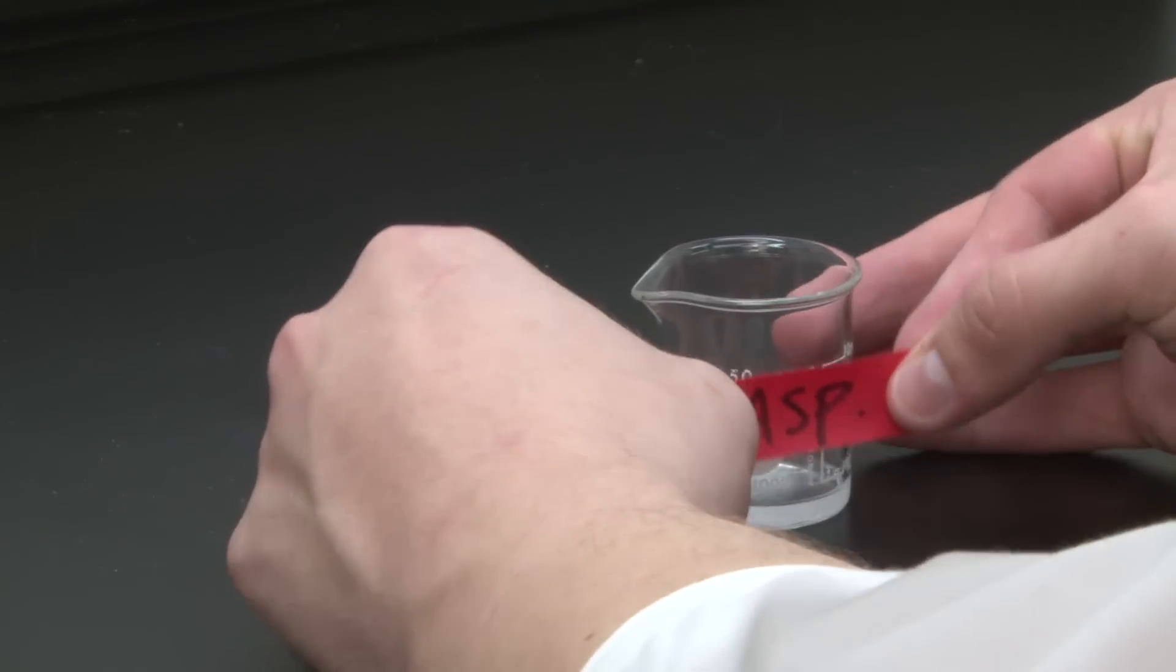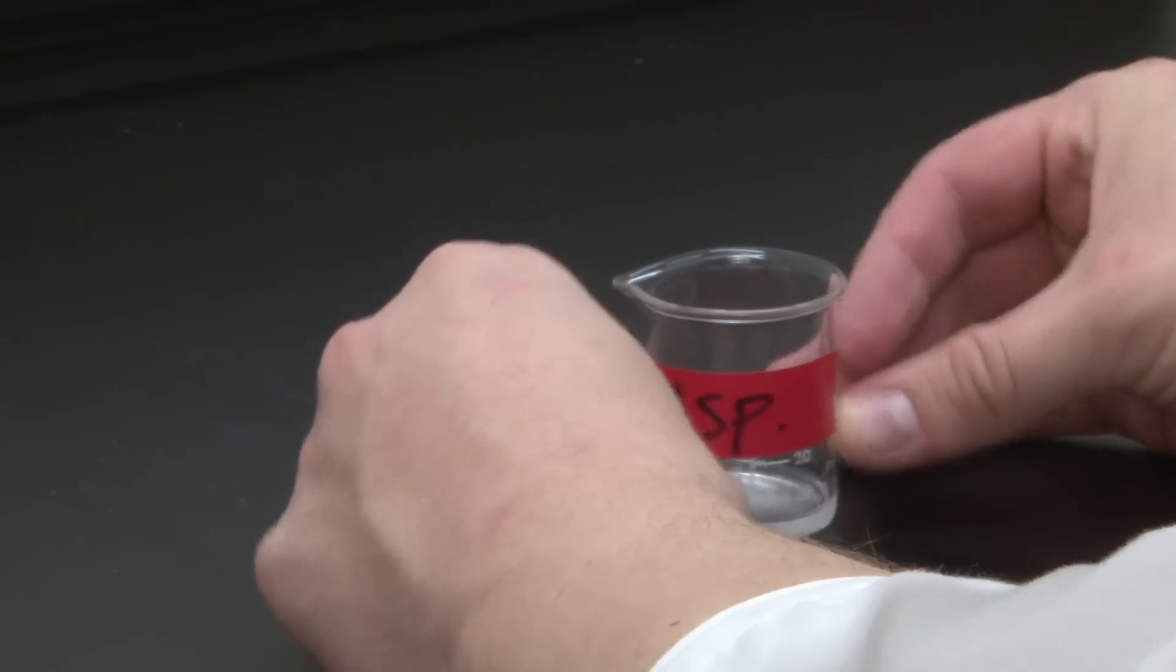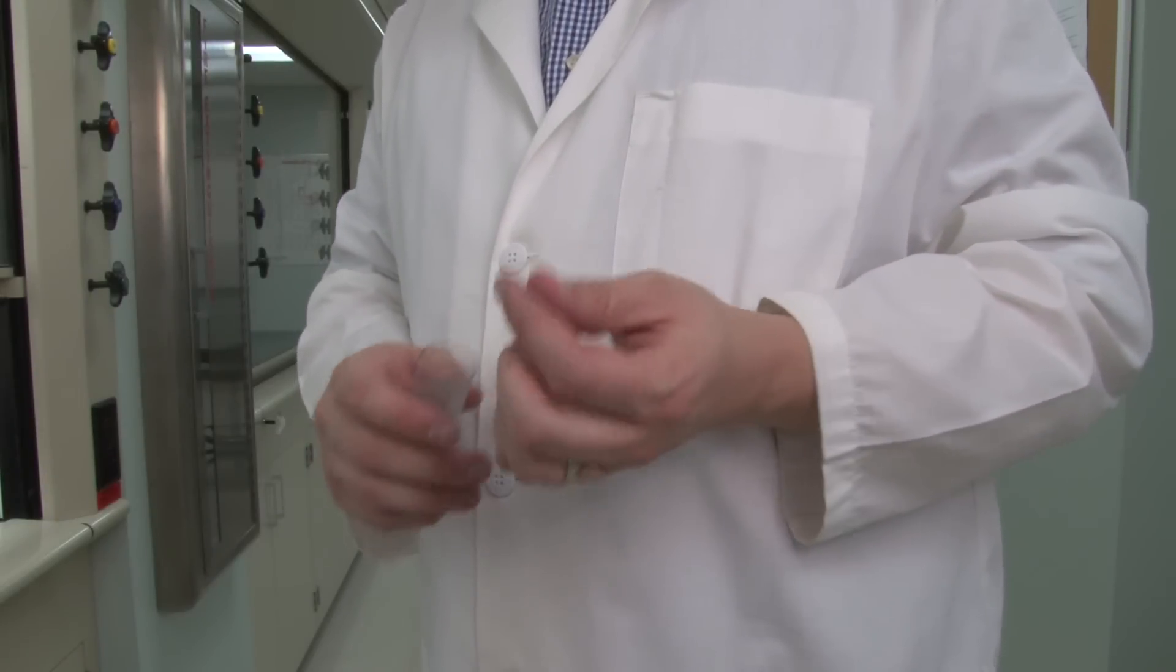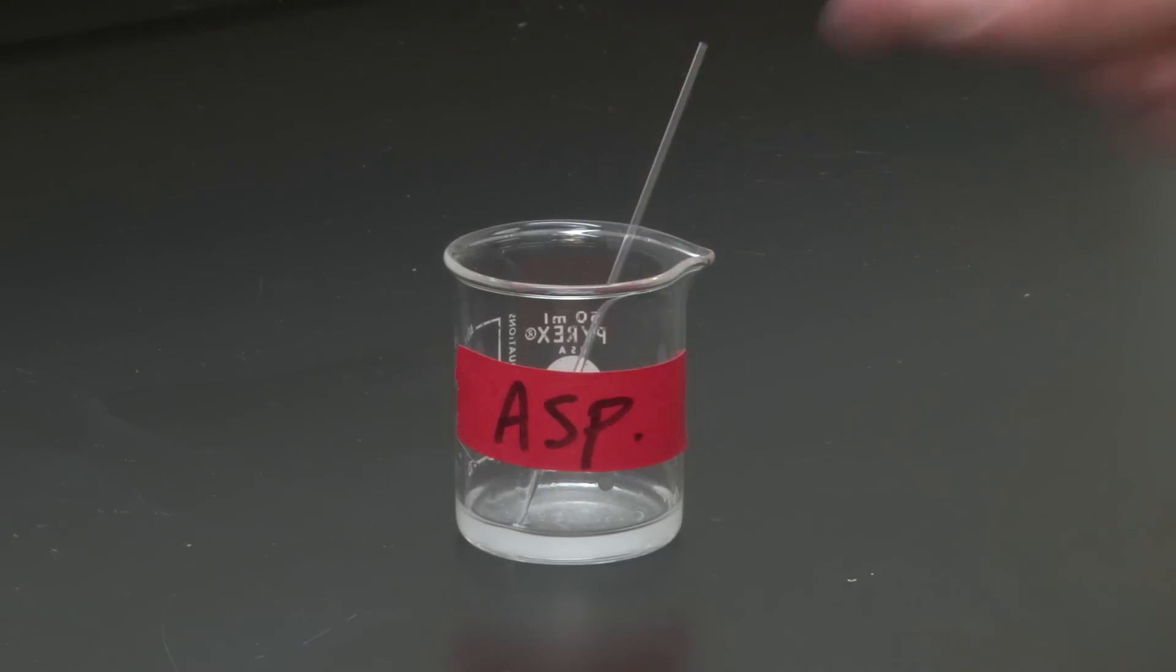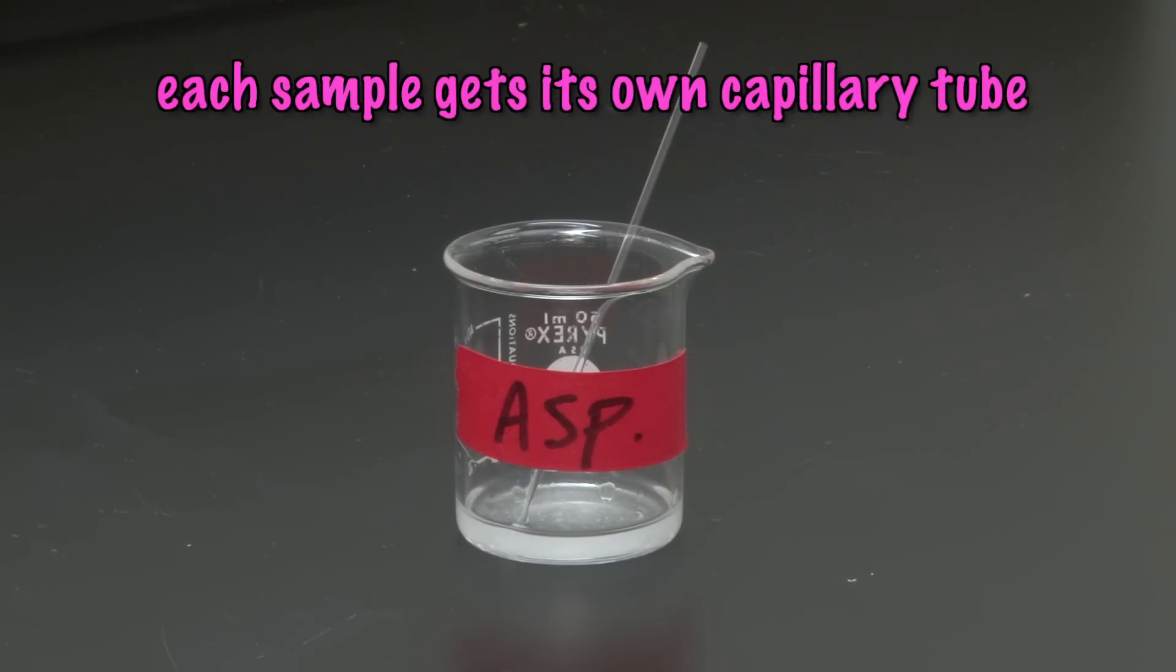Label the beaker with the name of the known substance and place one capillary tube in the beaker. It's important that this capillary tube only be used for this sample. Capillary tubes never come clean, so if we used this tube for other samples, the tube would still be contaminated with previous samples and they would show up in our TLC analysis. Leave the labeled beaker with the capillary tube under the hood.